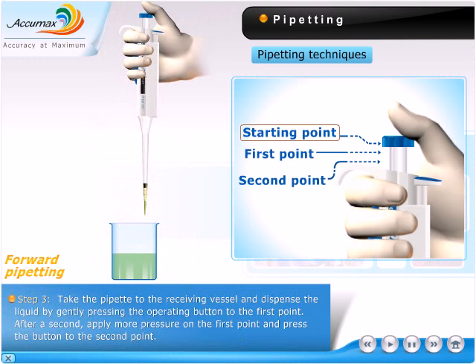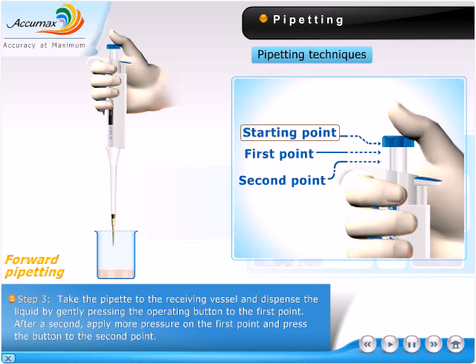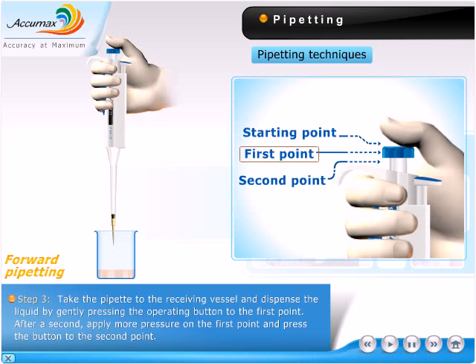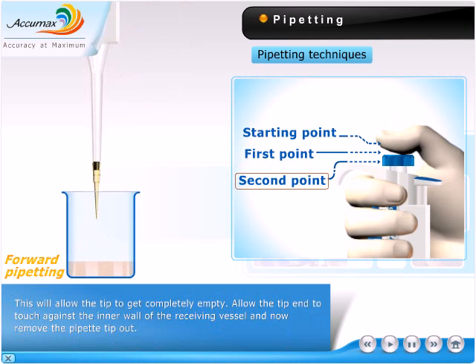Take the pipette to the receiving vessel and dispense the liquid by gently pressing the operating button to the first point. After a second, apply more pressure and press the button to the second point. This will allow the tip to become completely empty.